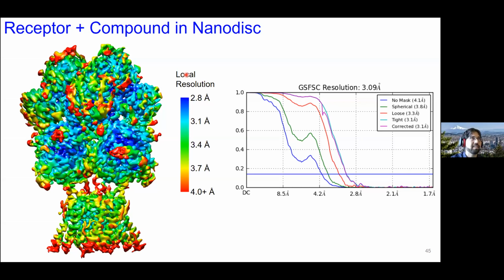So we've done this on some test data sets with smaller samples that have more of them inside the micelle. And if you start with a reasonable initial model, I think it's actually more helpful for those samples than these bigger samples. Because with these bigger samples, you would think that the 2D classes should be easier to distinguish.